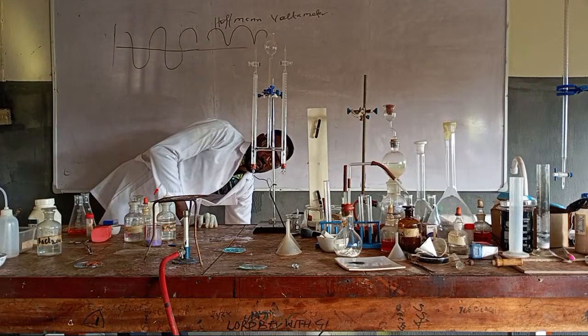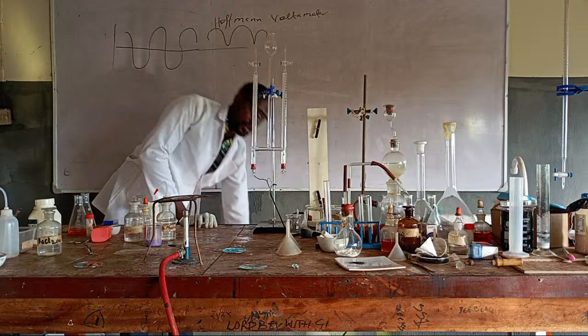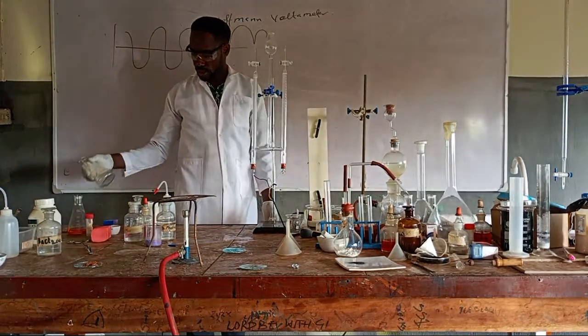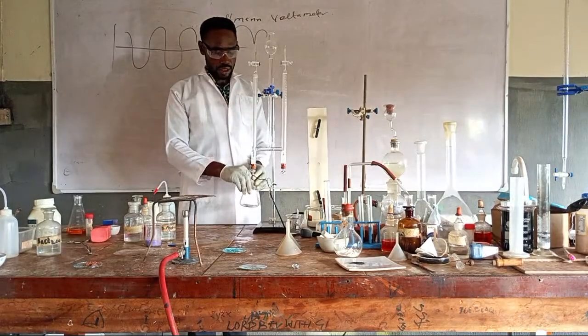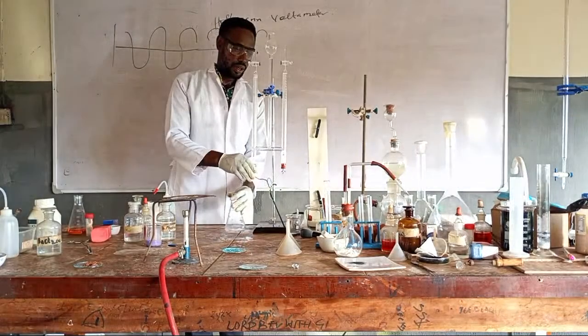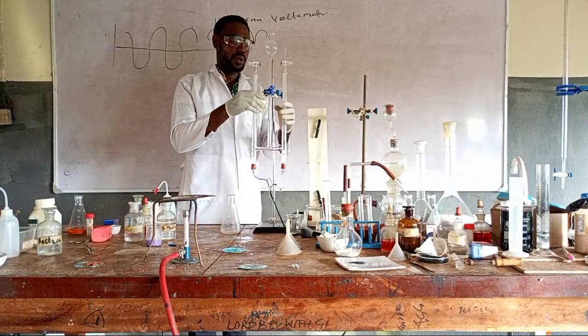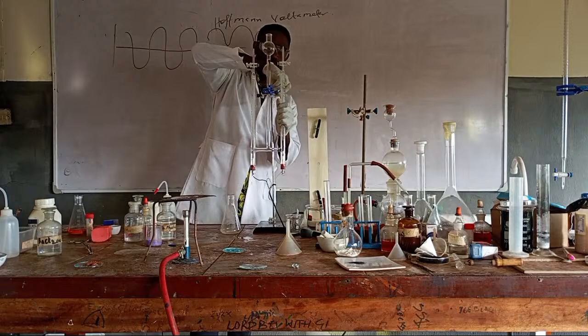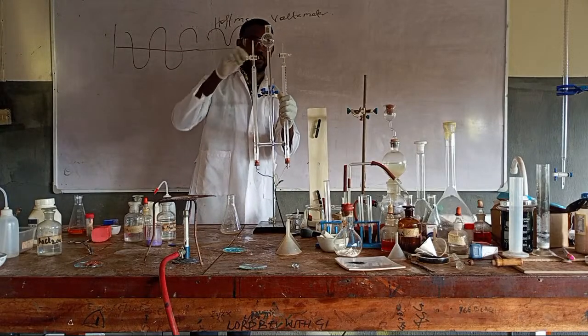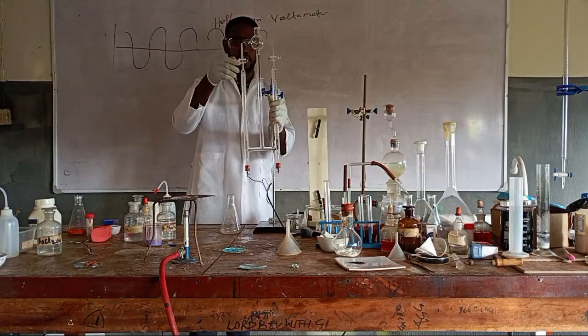I'm removing the source of this to increase the conductivity. I think this was what I used. So that it can give us a. If I open here, the water will still rush by force.